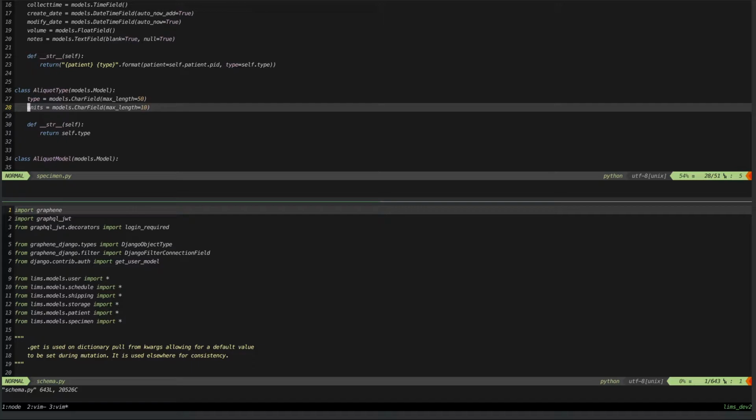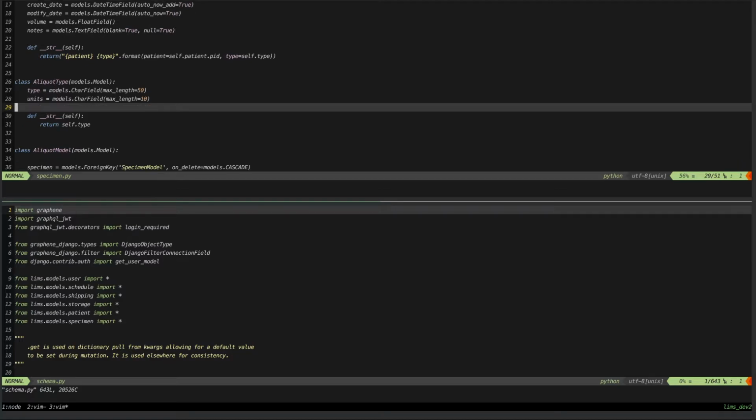Aliquot comes from specimen. So let's say you drew an initial blood sample of 20 milliliters. You might make 2 one-milliliter aliquots from that, and then send that off for testing, or run the test, or do whatever you need to do to procedurally create the thing that's actually being run on after the fact. So that's the relationship. An aliquot is always a child of a specimen.